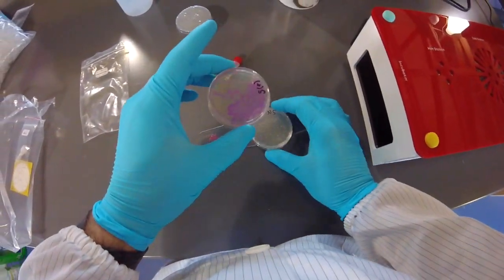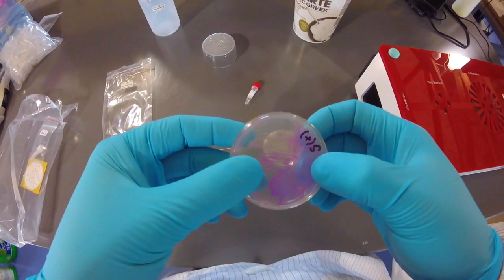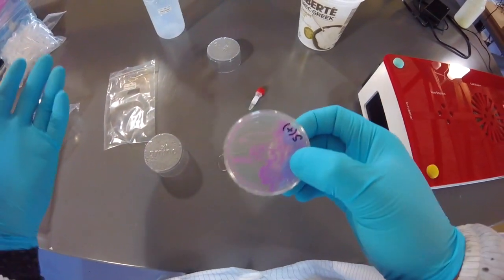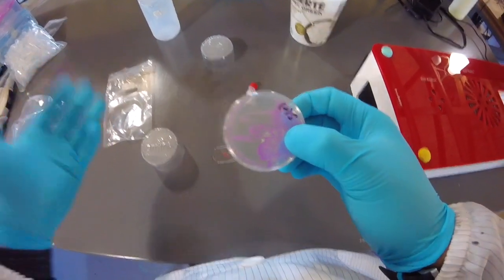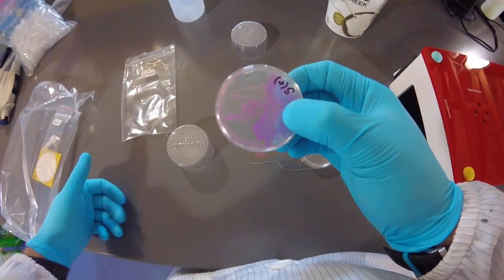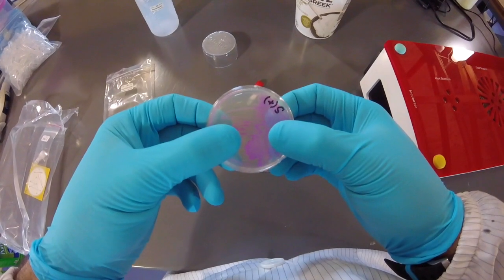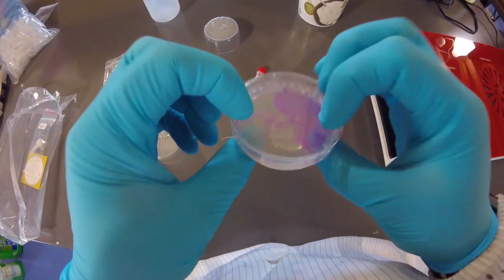All right, so let's start by looking at the positive control, and we can see that engineered cells do in fact grow on the selective plates. So that tells us a couple of things. One, it tells us there's not too much antibiotic, because you'll remember that the plasmid has a gene that creates a protein enzyme that breaks down the antibiotics as they're entering the cell. It's like a defense, right? There's only a certain amount of enzyme produced, so you can overwhelm the cells if you have too much antibiotic, and then the cells simply won't grow and survive, okay?